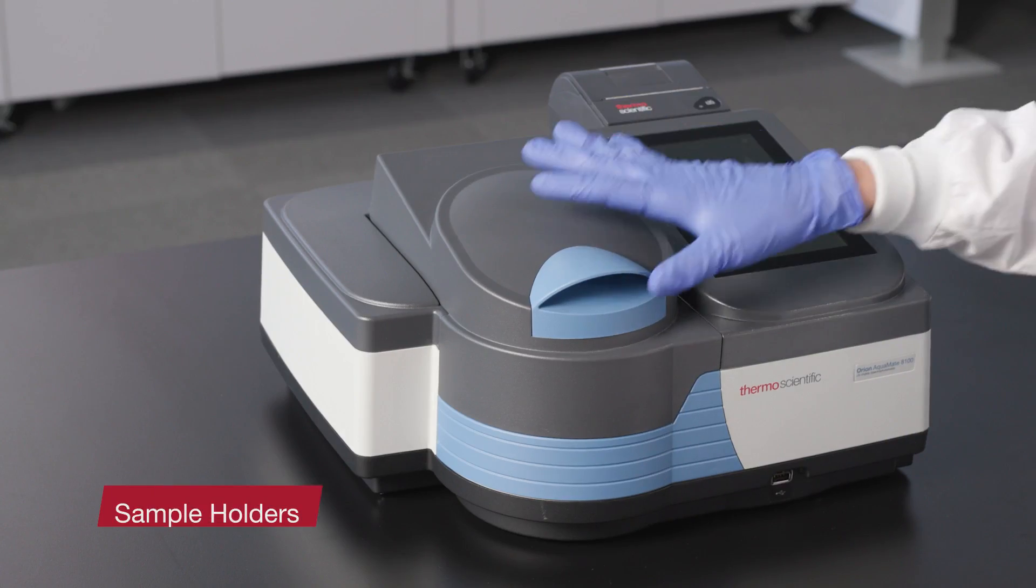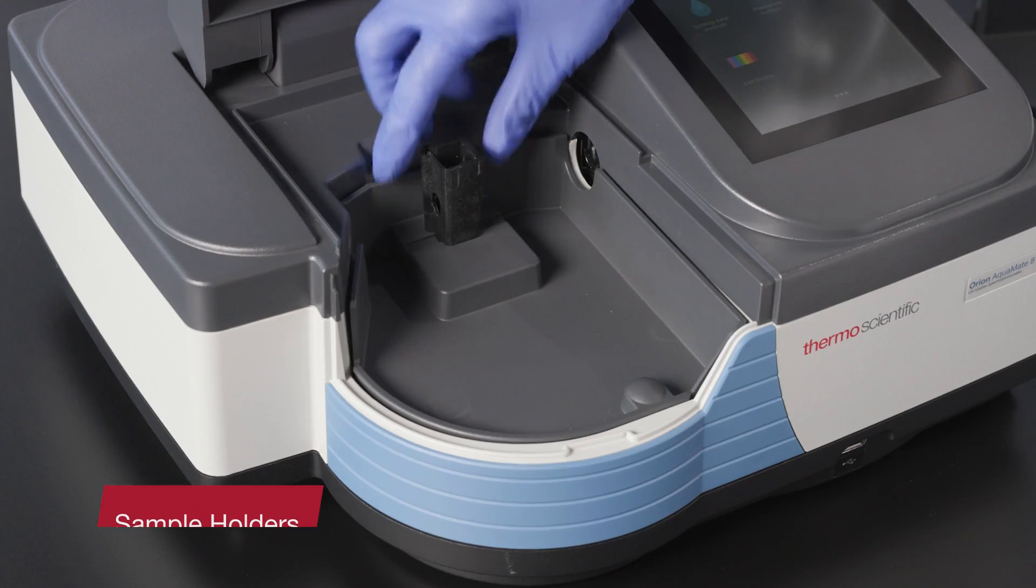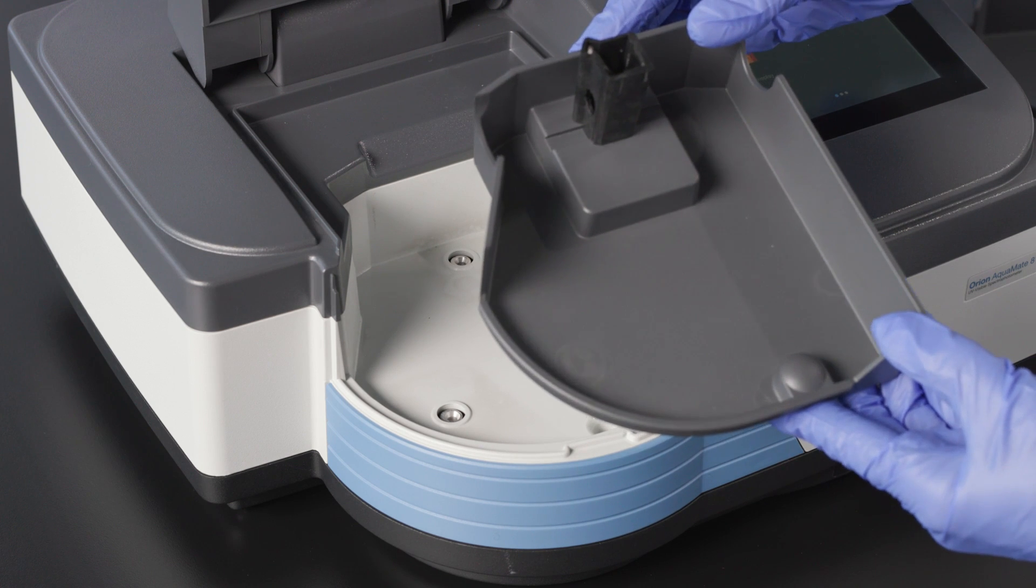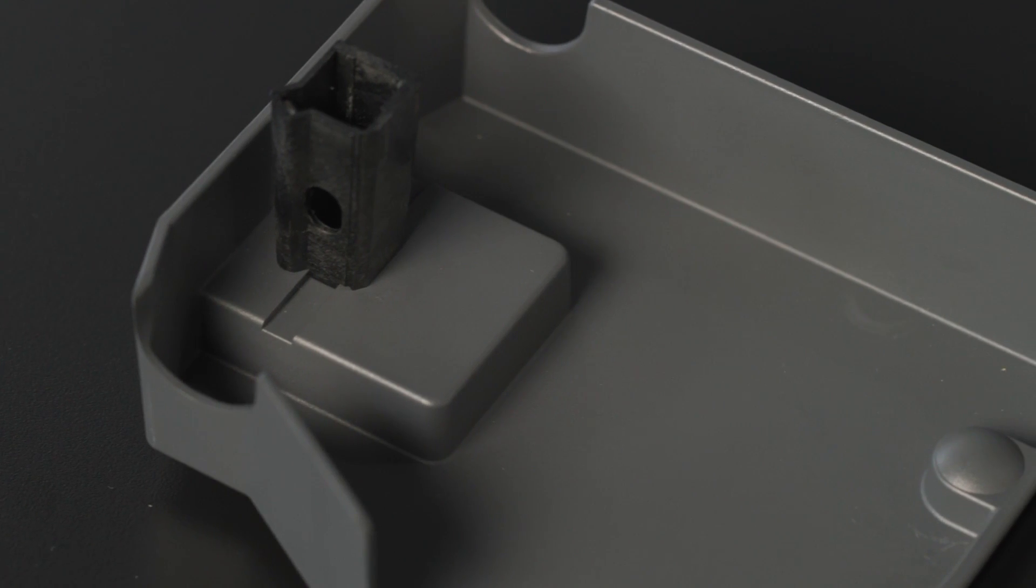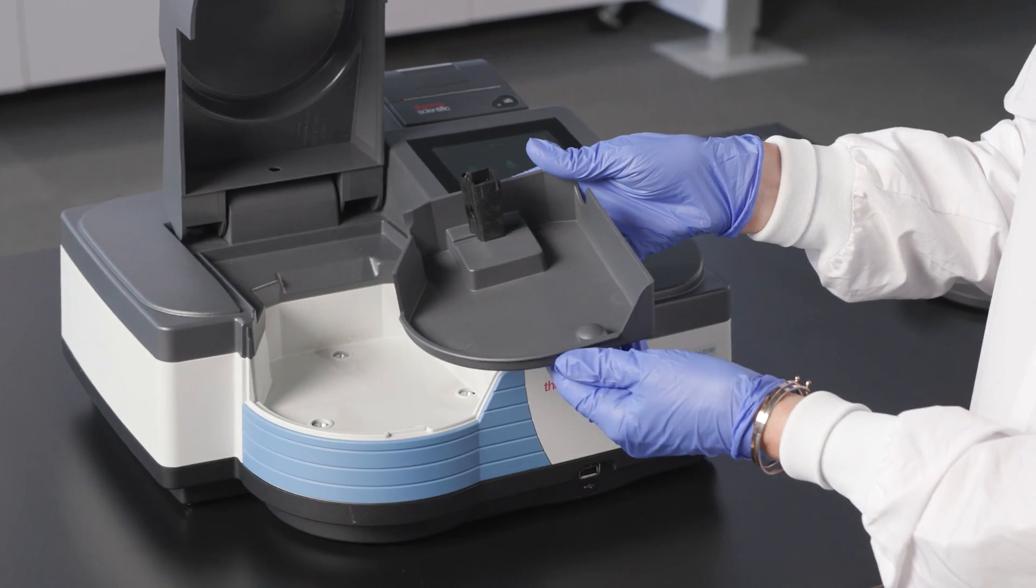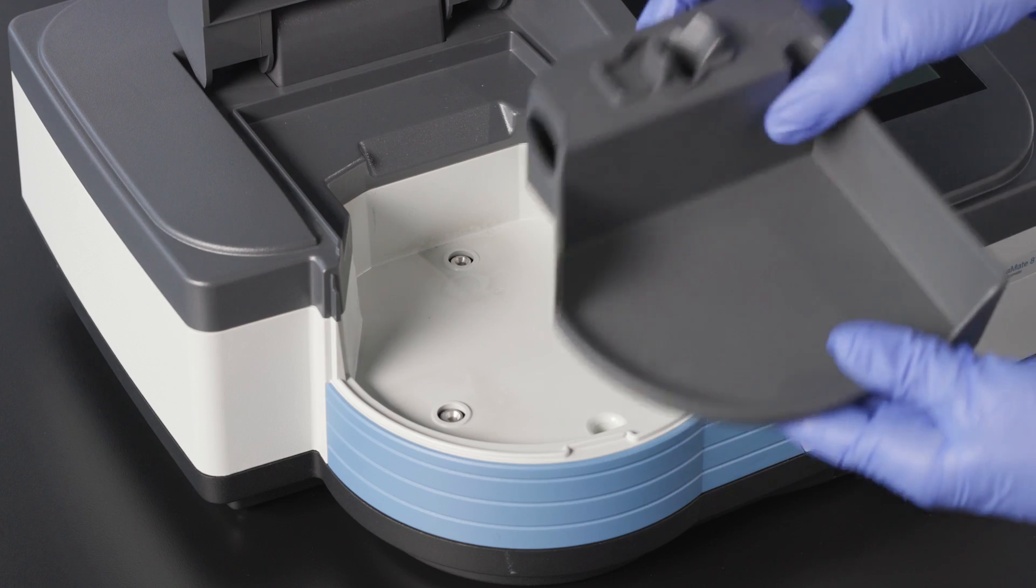Another interesting feature is how the sample holders are retained. The sample holders are held in by magnets, so they're very easy to change. There's also a well in each holder, so it's easy to contain and clean up any accidental spills. The magnets have a satisfying positive engagement.